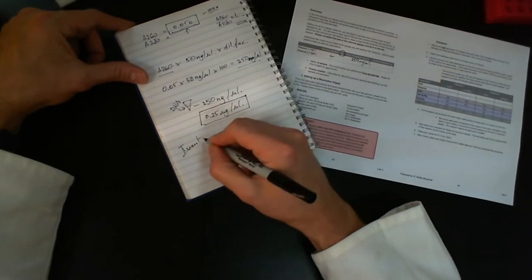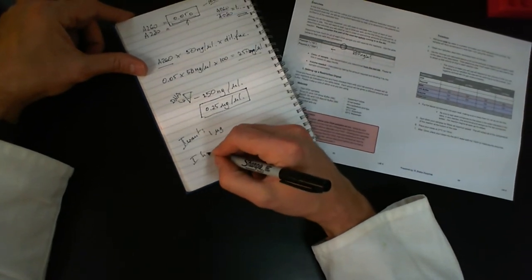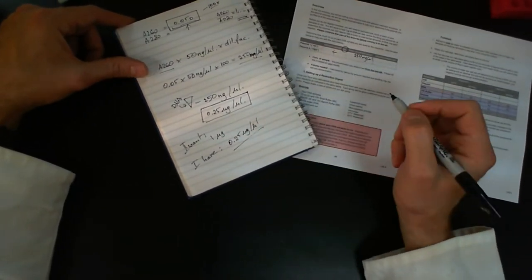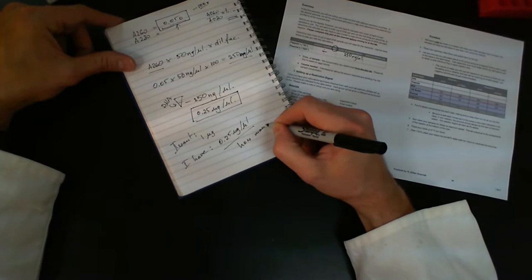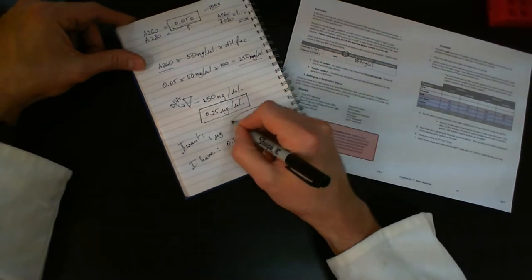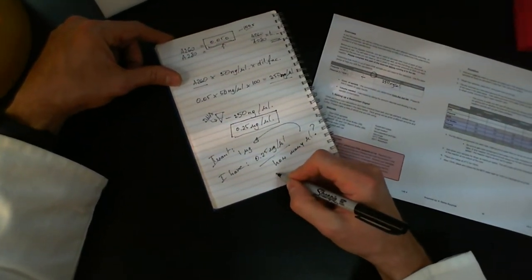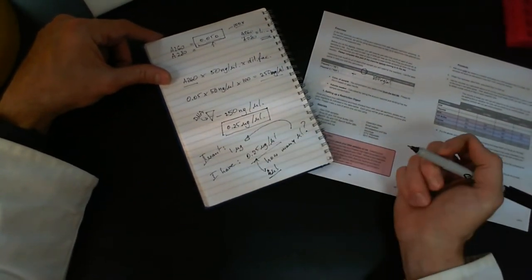So I want 1 microgram, and I have 0.25 micrograms per microliter. How many microliters do you need to get to this? In my case, I'm going to give you the answer: 4 microliters, because 4 multiplied by this will give me 1 microgram.